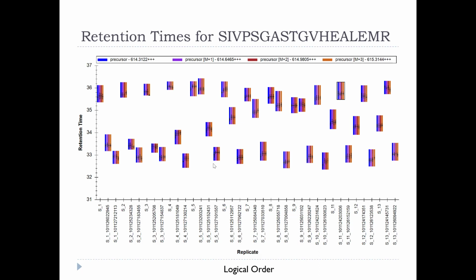Does anybody have an explanation? Difference of matrix, yeah. So come up with some ideas, explanations. I'm denying you some information. How do you explain this?